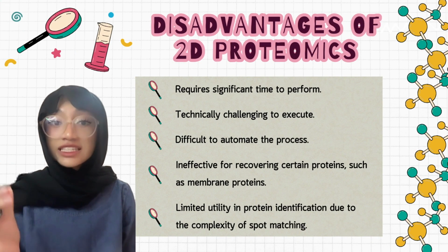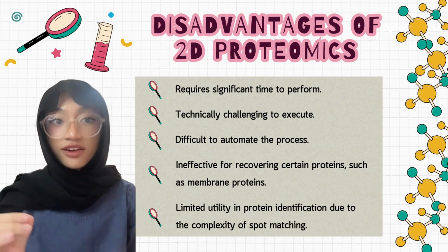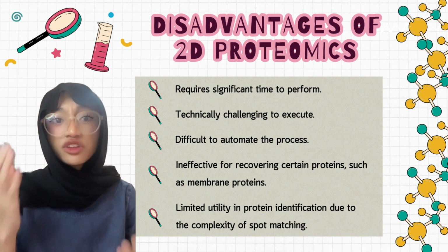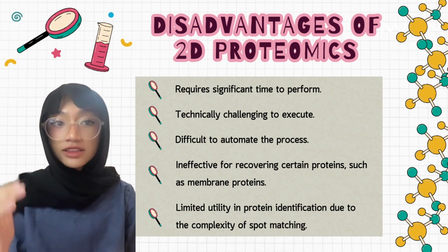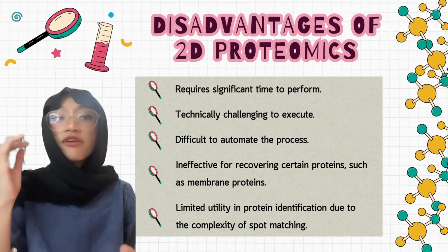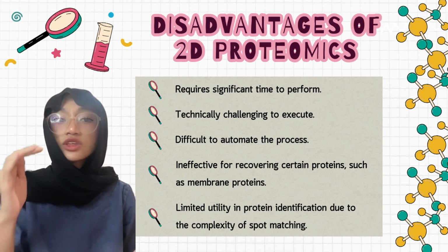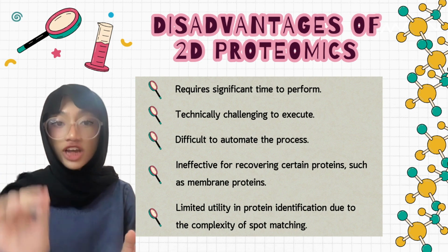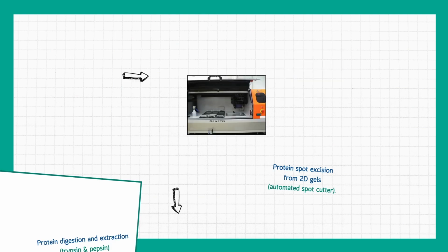Now, onto the disadvantages. This technique is time-consuming and technically challenging. Automation is difficult and it's less effective at recovering certain proteins, such as membrane proteins. And finally, it has limited usefulness in protein identification because matching spots on gels can be complex.